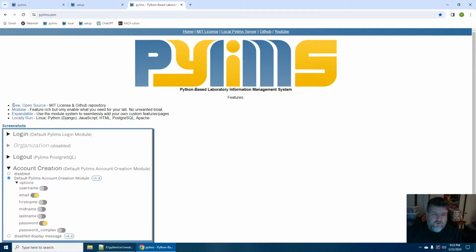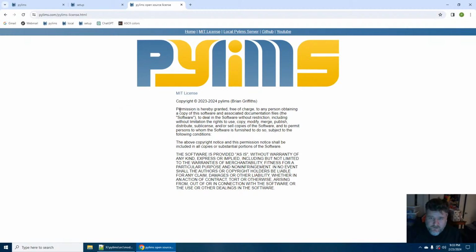I just added a quick little blurb about the project and my ideas for it, which is free and open source. I also included a link to the license that just says, use this. Just say that I made it if you use it. Whatever. And if you break it, your own problem.